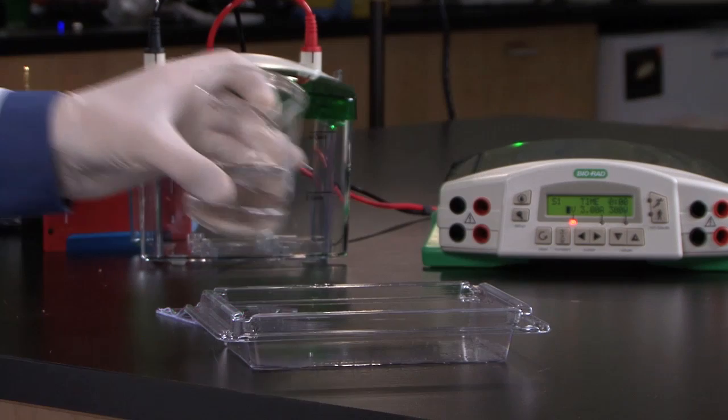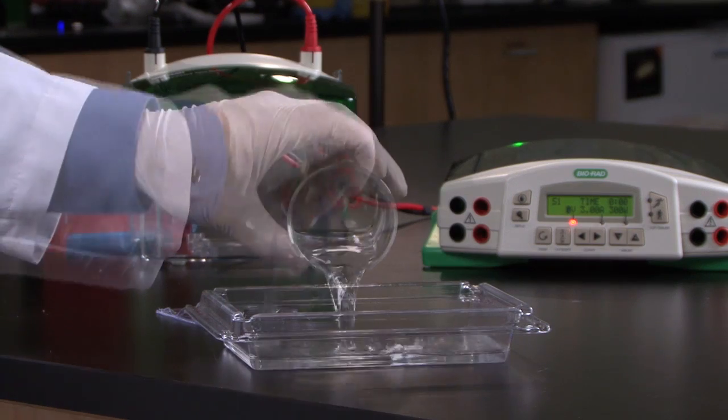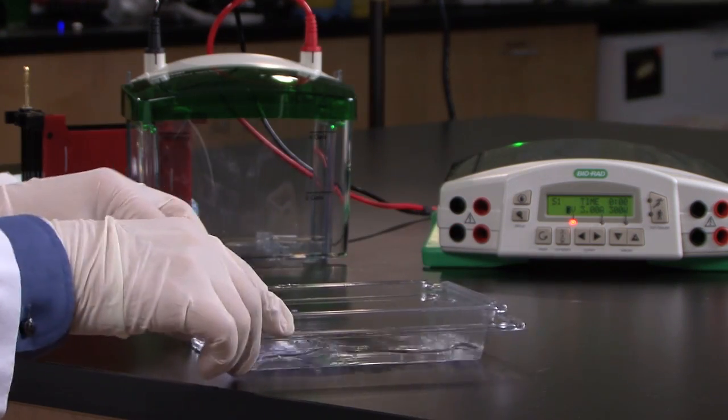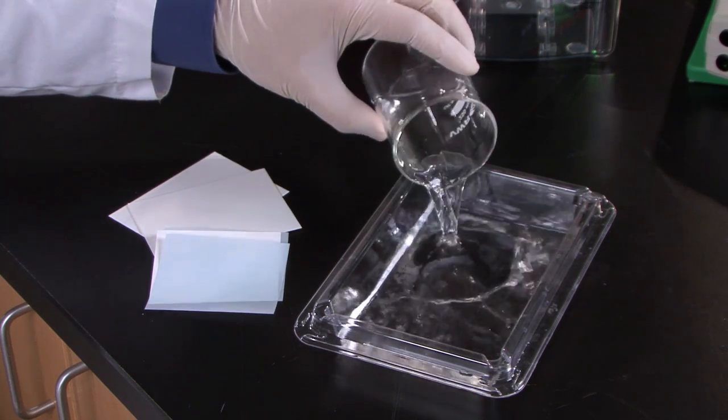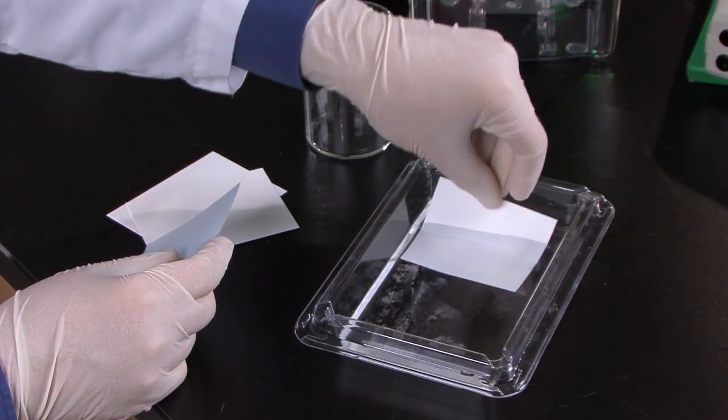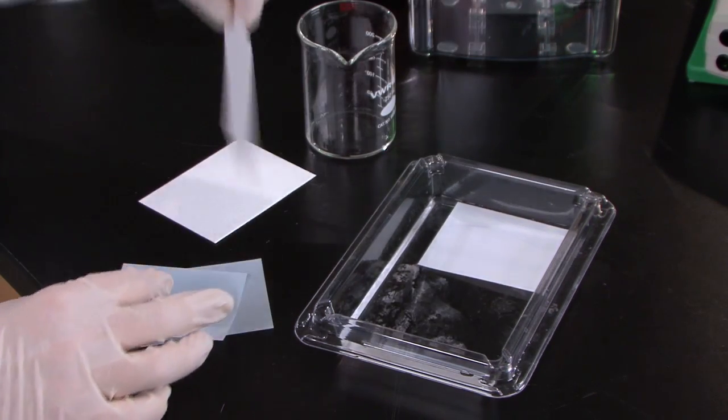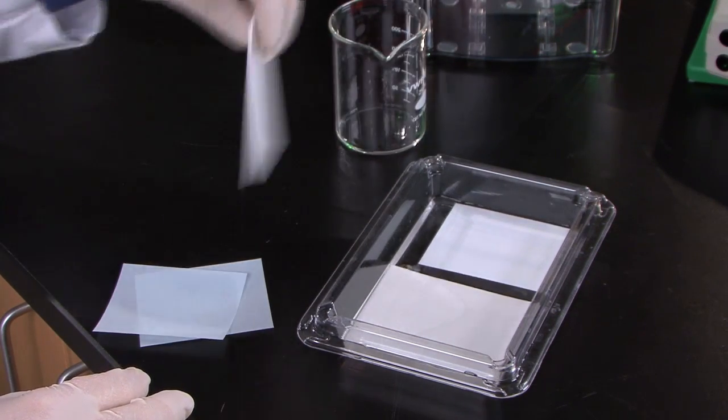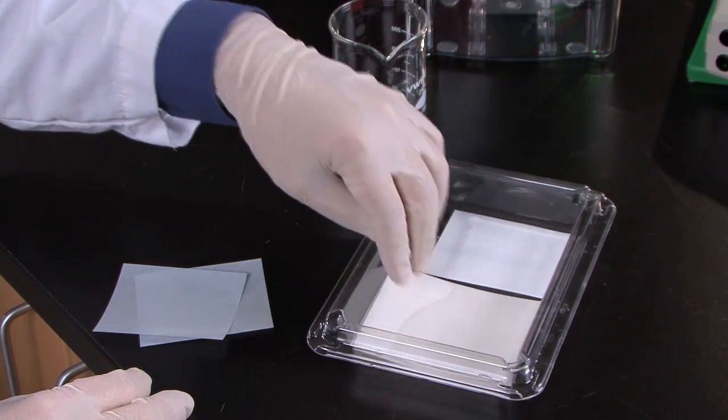The first step in preparing for a tank or semi-dry transfer is to equilibrate your gel for 10 minutes in transfer buffer. Next, you may have to cut blotting paper and transfer membrane to match the size of your gel. These must also be soaked in transfer buffer. In addition, PVDF membranes need to be wet in methanol prior to soaking in transfer buffer.